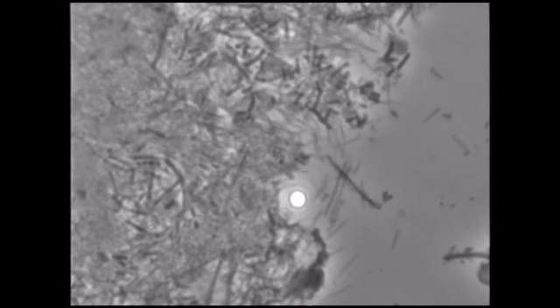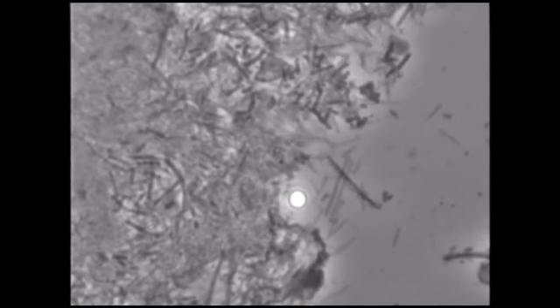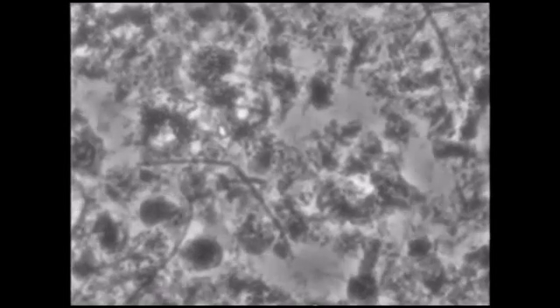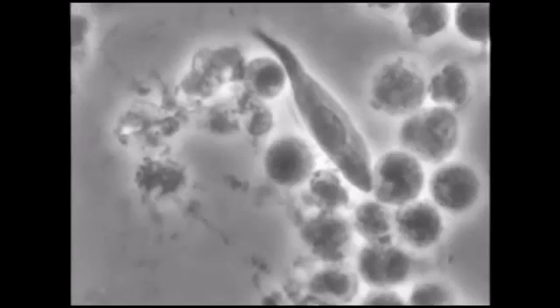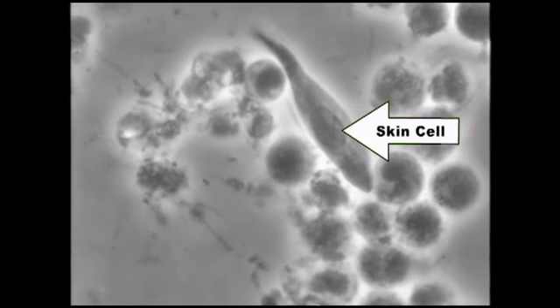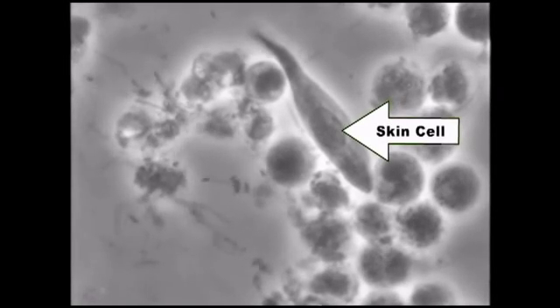Here are some very active large gliding rods. The white spot in the center is an air bubble. These are small gliding rods with white blood cells. Here are some spirochetes again attacking a white blood cell. This is a skin cell on its side and white blood cells.